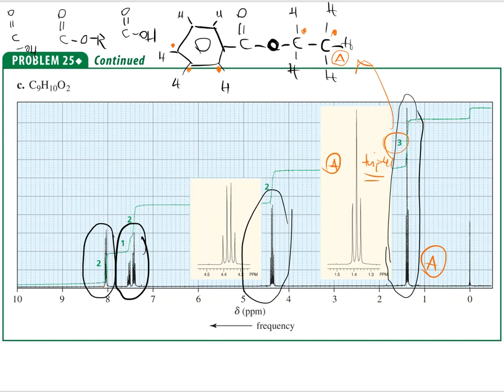And then we go on to the next closest one with all of this mess with the electrons. And this would be here at that spot. So that would be C. And it looks like that this possibly would be B that's here. And that is 2 carbons. I'm getting a different shift. We've already said that. And then next door is 3 plus 1 is 4. So we're getting a straight up quartet here. Again, not a double of doublets, but a straight up 3 plus 1, which is 4.